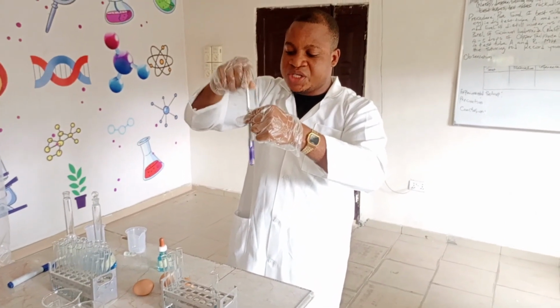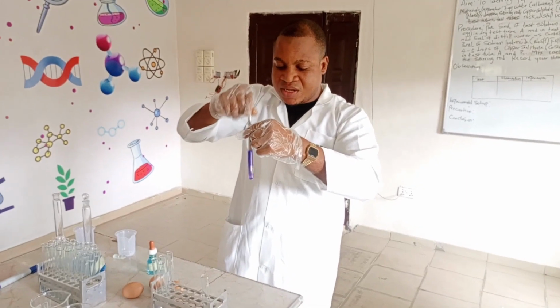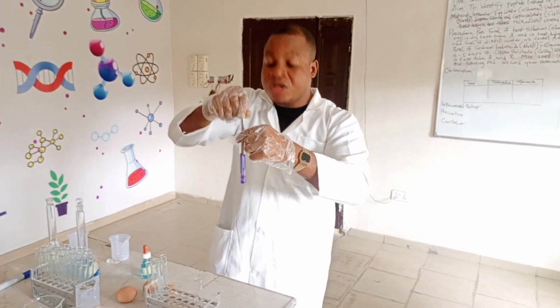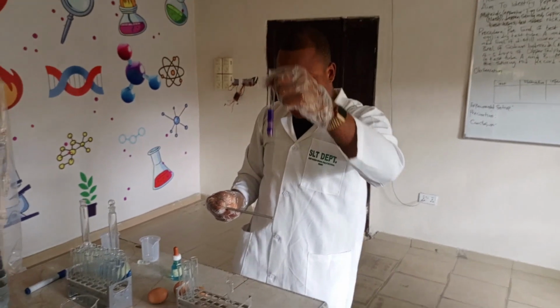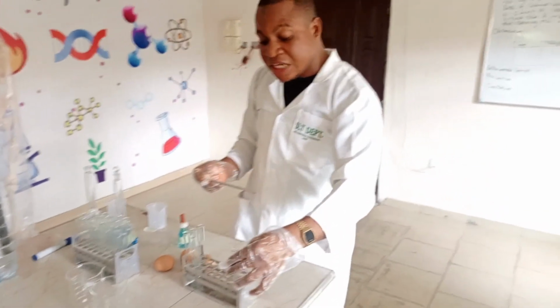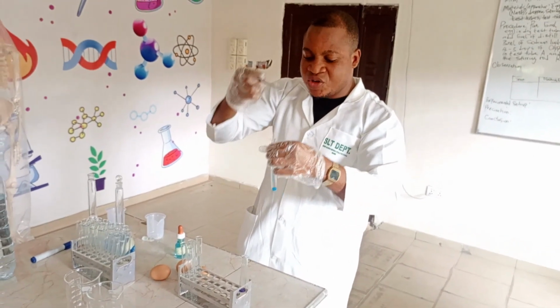I've told you proteins undergo different color reactions. And from our procedure, when we carried out the Biuret test, I told you a purple or violet coloration will be formed, just like you have seen here. In here is a purple or violet coloration. Now this is the test solution. Now let's see B. In B, there is no purple coloration.